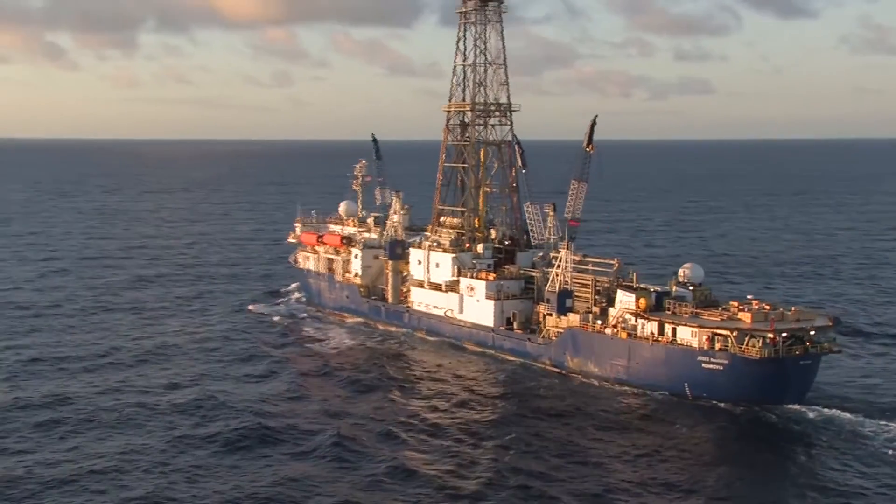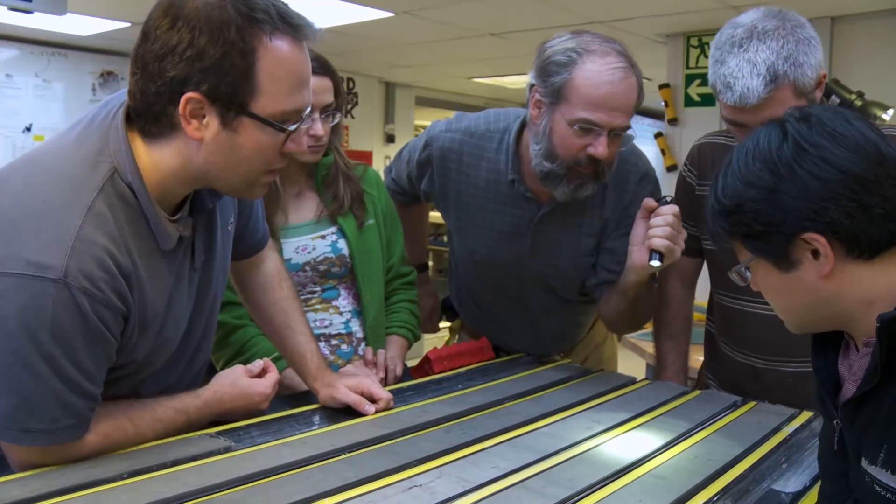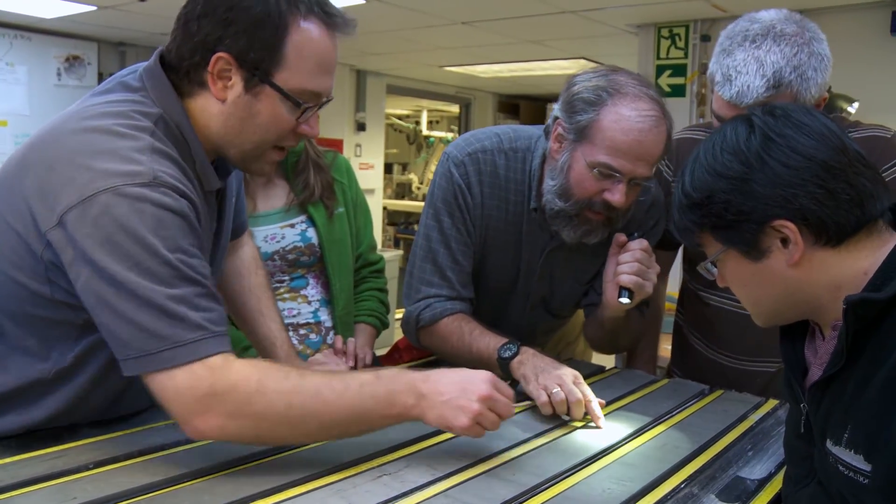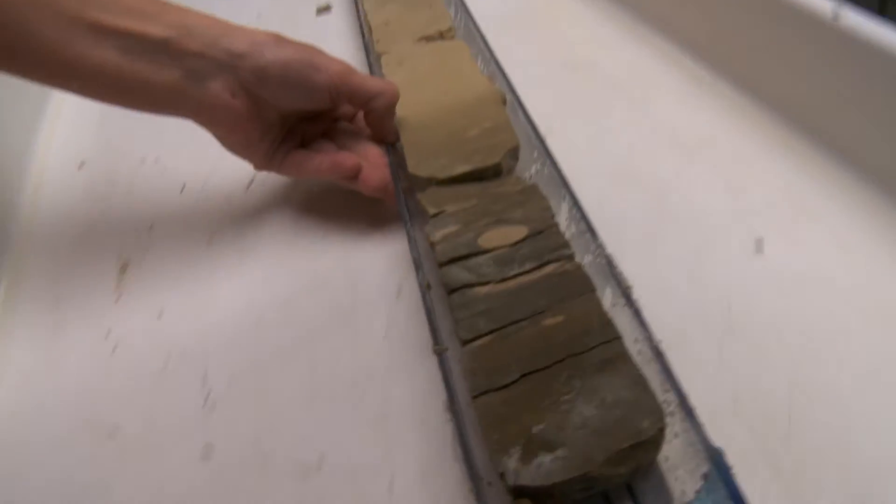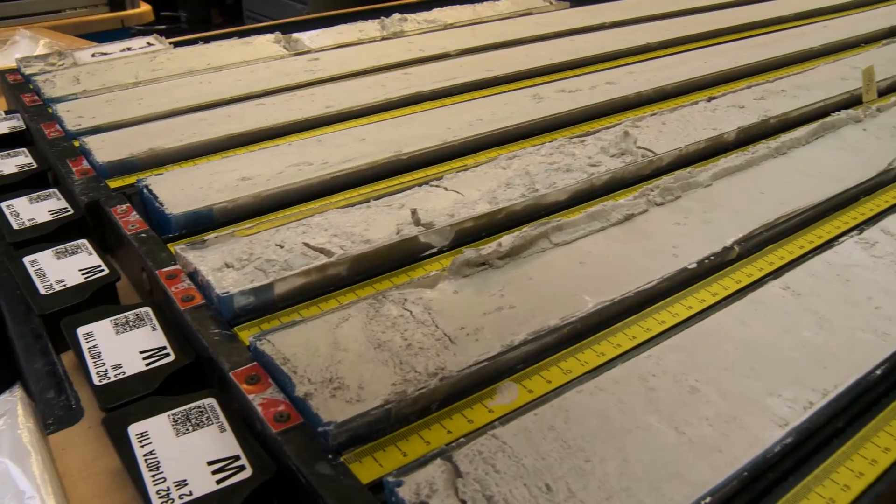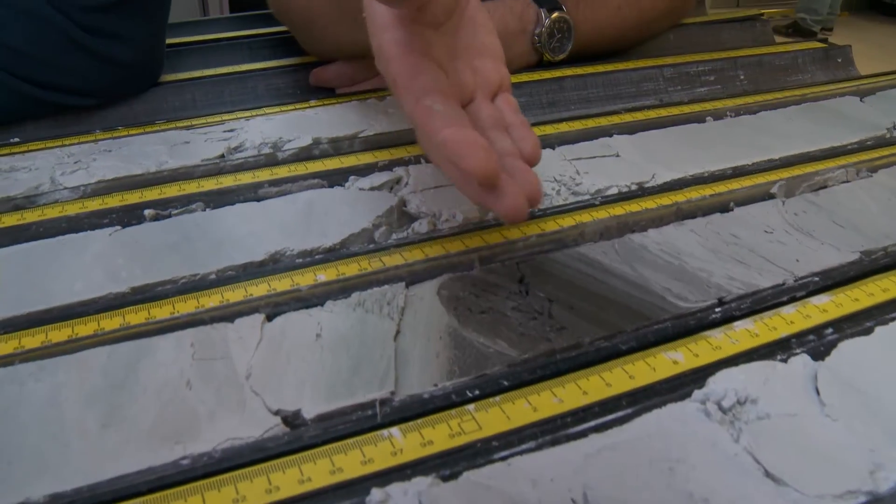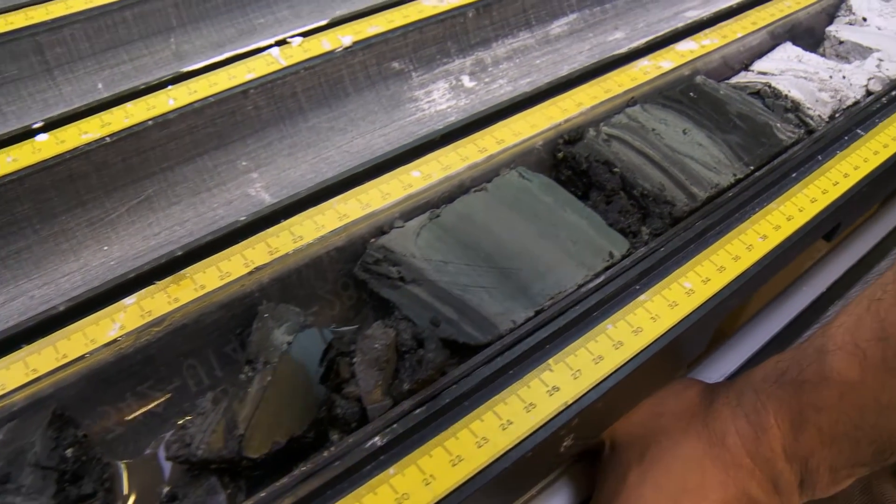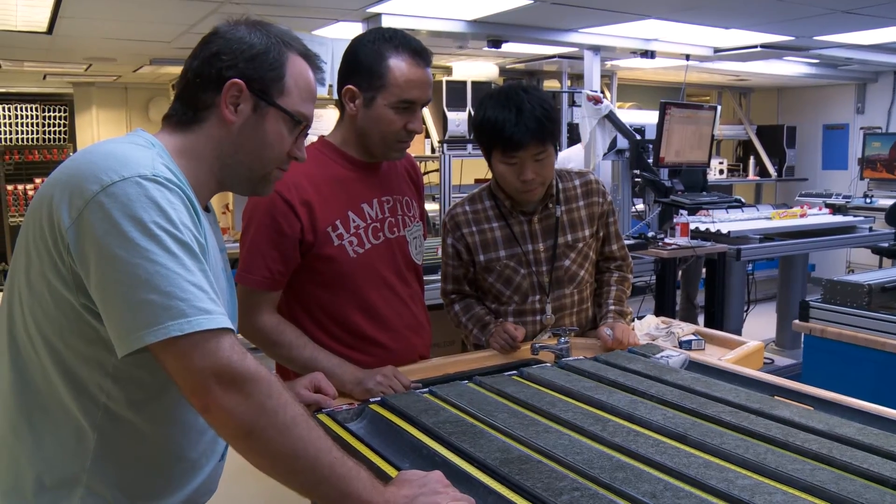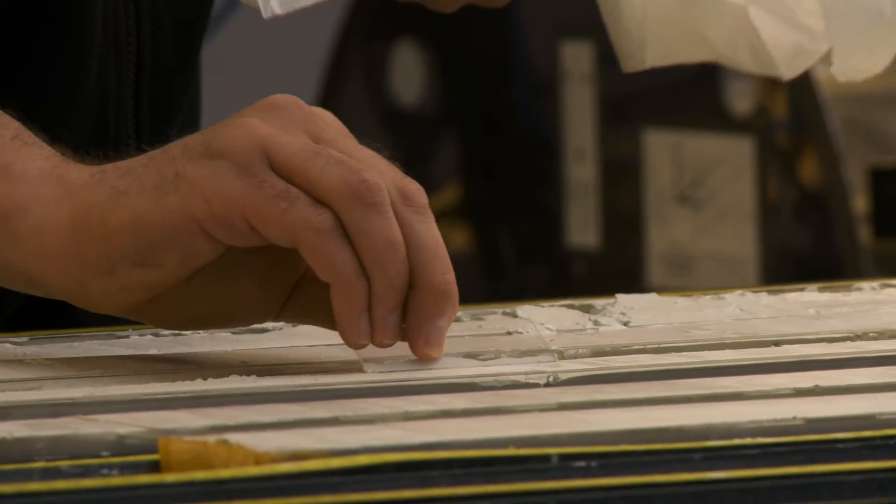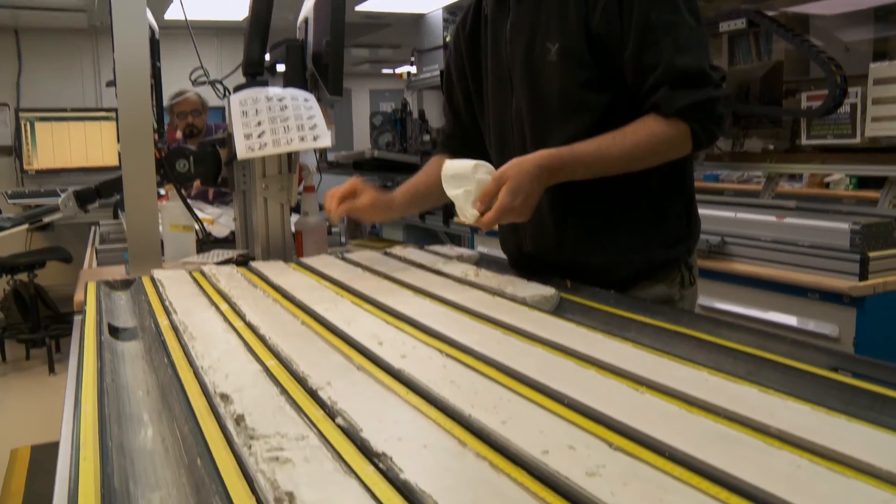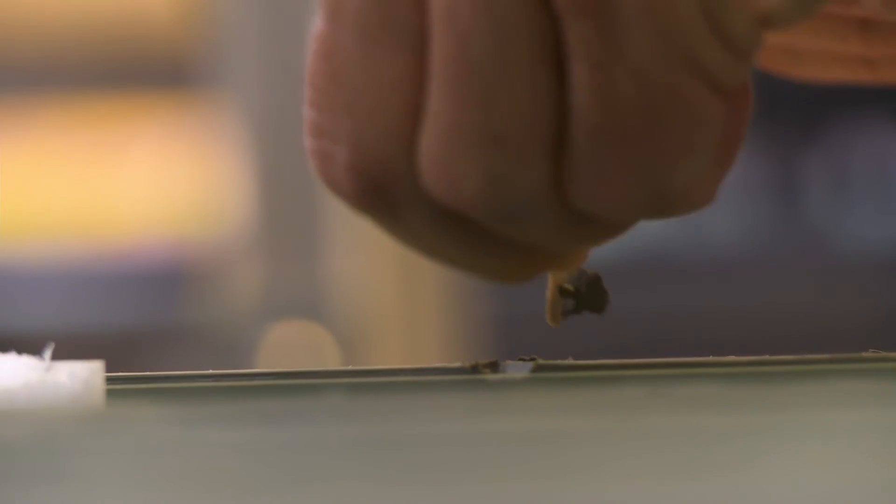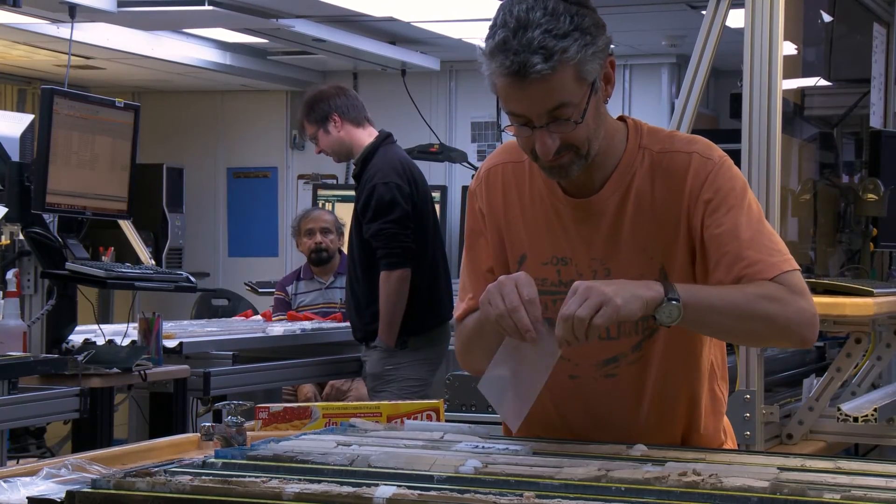Our job on the ship is really to track the variation preserved in the sedimentary record. And that allows all of us to understand how complete the record might be, how discontinuous it might be, how uniform it might be in its composition, whether or not there are specific instantaneous events preserved in the record. And by doing that, that informs the whole science party about the next questions we can ask from that sedimentary record. And it informs the post-cruise research that happens a month after the cruise, a year, five years, ten years after the cruise.